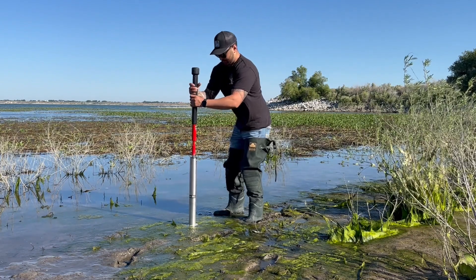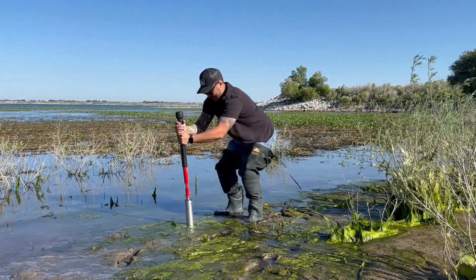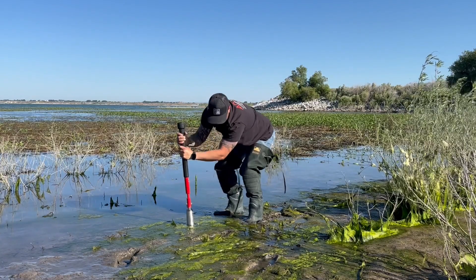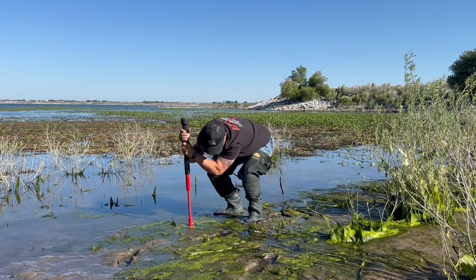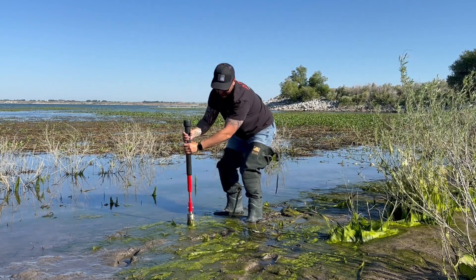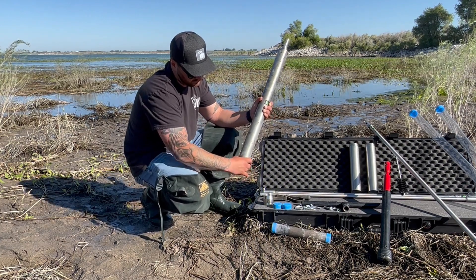Now let's drive our larger sampler into the sediment so we can retrieve our sample. In certain situations, there may not be a need to connect the sampler to an extension. In this video, you will notice that we connected the slide hammer directly to the flat valve cap. Once we reached our sampling depth, we reverse hammered with the slide hammer to retrieve our sampler. The steps for retrieving your sample remain the same, regardless of the sample size.